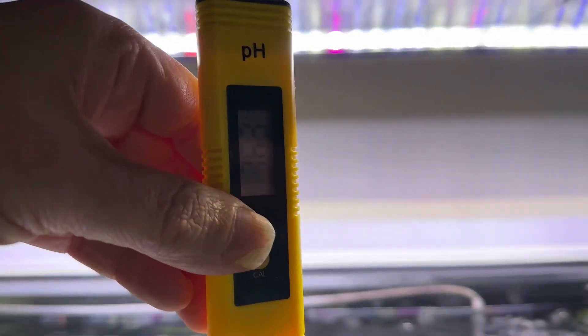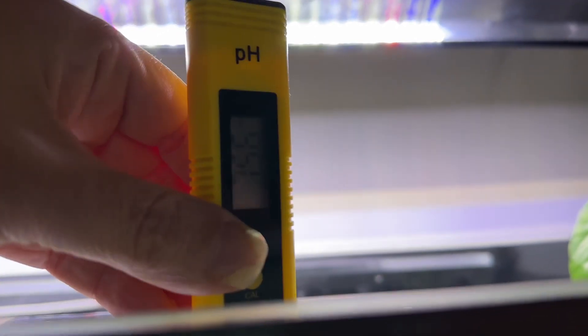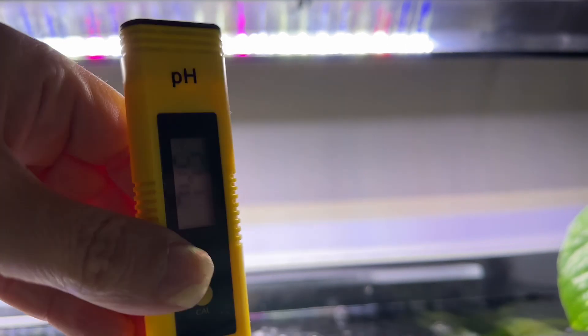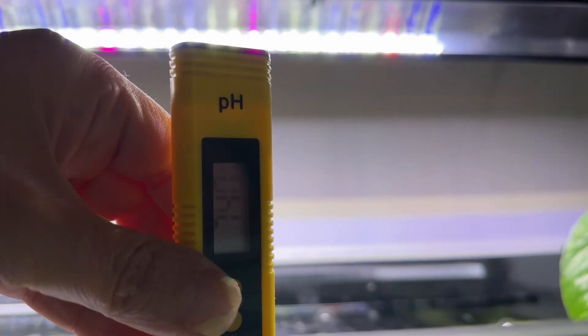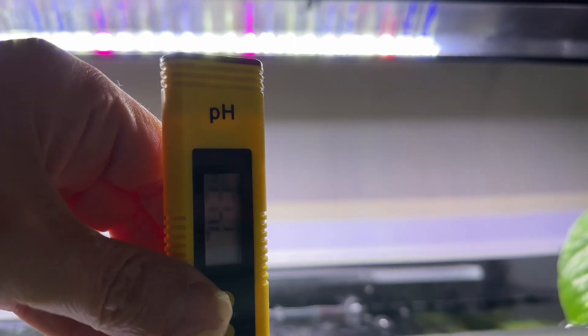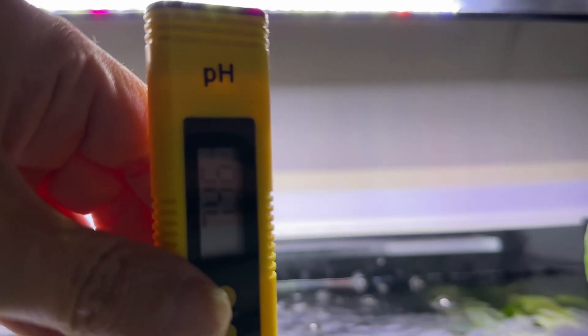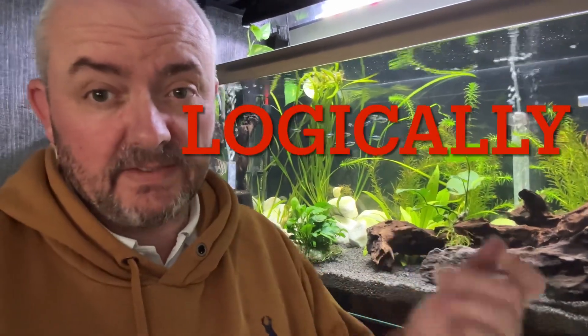It's going down — 6.1, 7.5, a little bit longer, 7.3, 7.4. So it's settling around 7.4. Between the two tests, that's almost one full degree difference in pH.